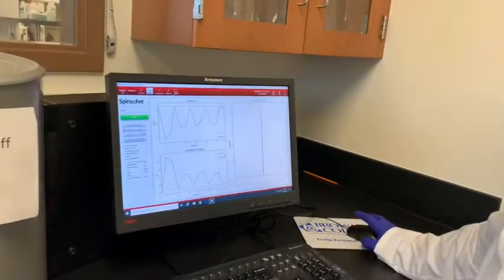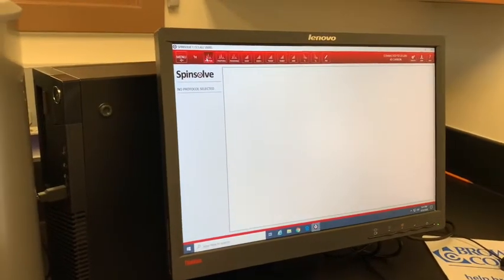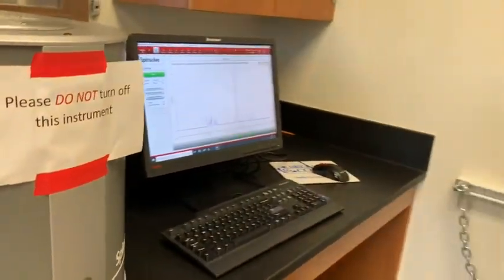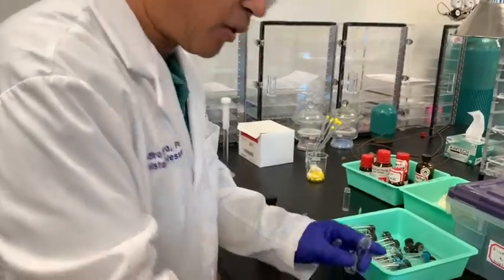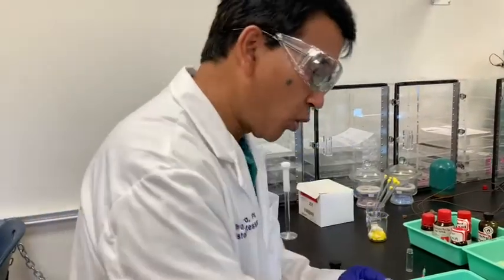So I will click there, and I wanted to take the proton NMR. So this is where I will use the proton NMR. So this is not the spectra, by the way, this is for the other samples there. Okay, but we will prepare the sample first. All right, so this is the sample, and a very small amount of sample is needed. So this is a good amount there. I will use a few drops, a couple of drops here. So that's more than enough.